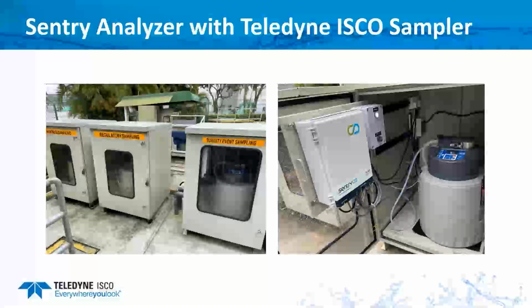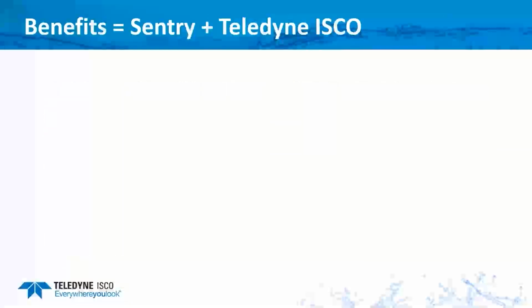And when I open that third sample box, the entire box, this is how it looks. That is how they have the interface. That's the right side picture. So this is basically used for two separate sets of samplers, for regulatory and event-based.